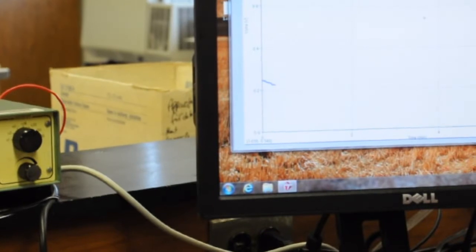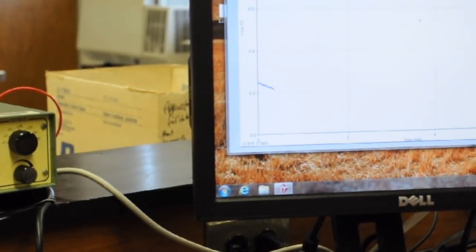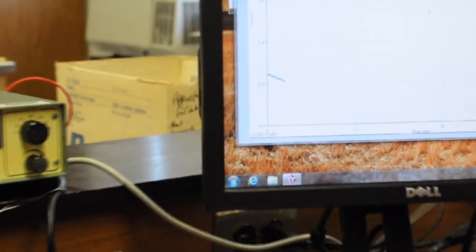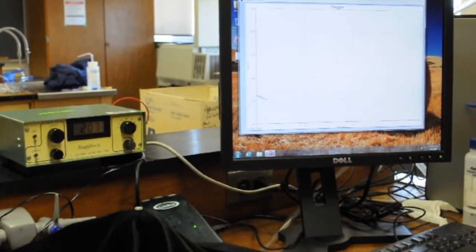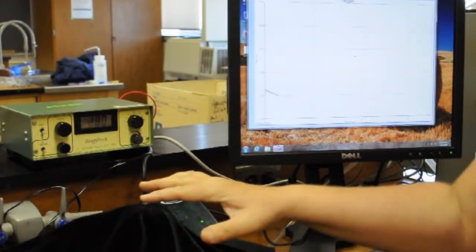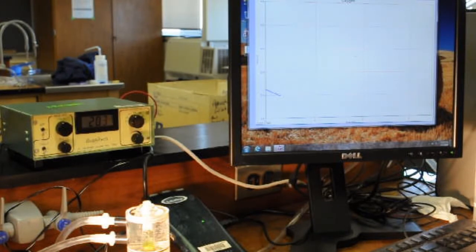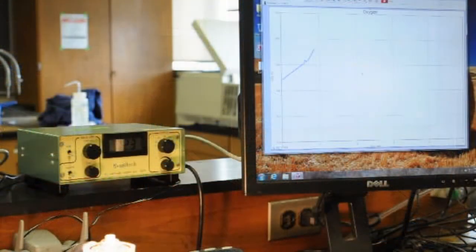Since your sample is in the dark you should see either a flat line or a line with a negative slope. A negative slope indicates your sample is consuming O2. To check for photosynthetic activity remove the black cloth and turn on the light. If the cells are evolving more O2 than they are consuming you will get a line with a positive slope.